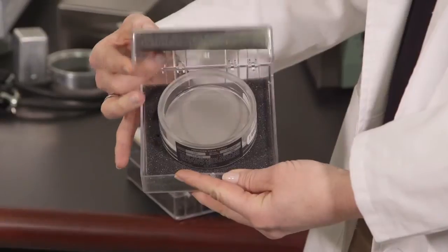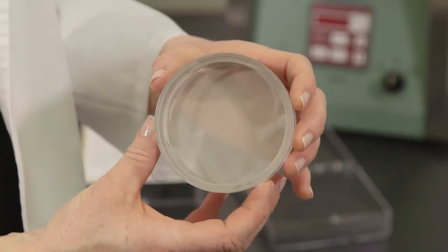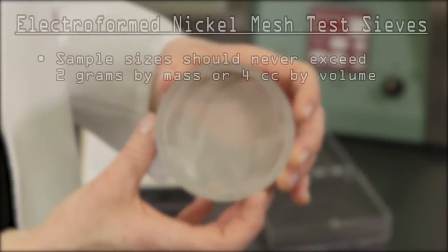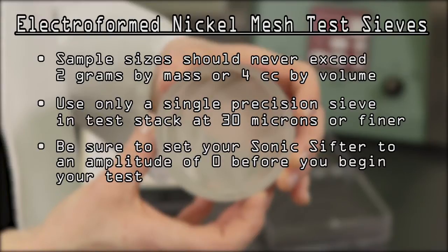Electroformed nickel mesh test sieves are extremely fragile and require very special handling. Long service life can be obtained by observing the following guidelines. Sample sizes should never exceed 2 grams by mass or 4 cc's by volume. Use only a single precision sieve in your test stack at a time when performing separations at 30 microns or finer. Always be sure to set your sonic sifter amplitude to zero before beginning your test.